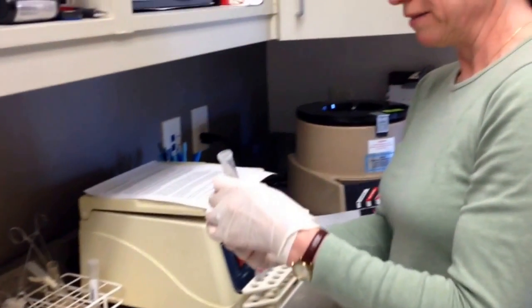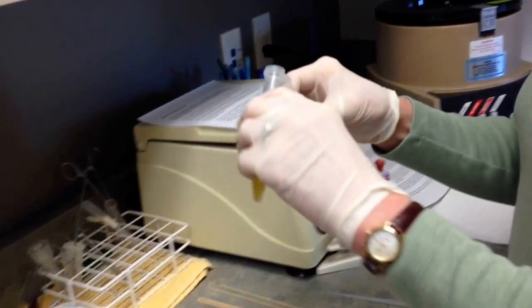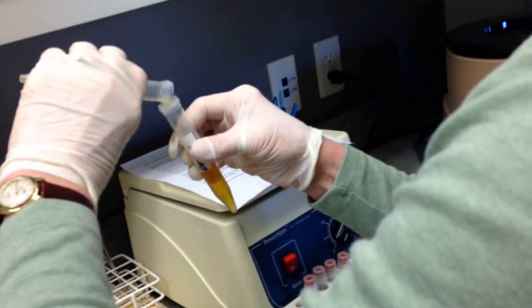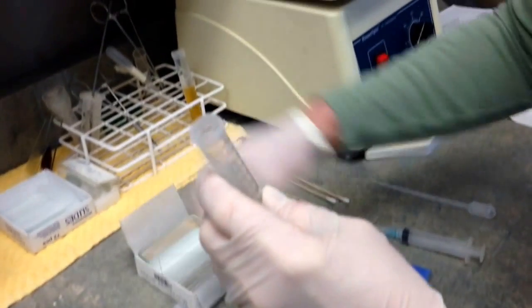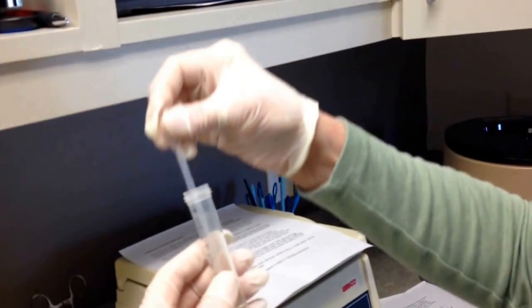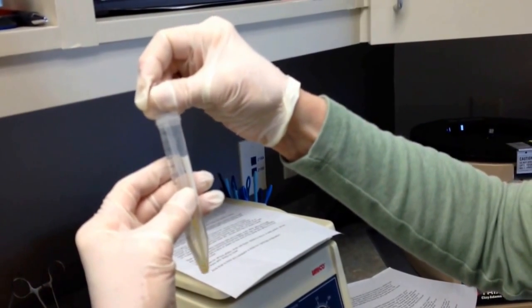If you have a fluid sample such as a urine or a body cavity effusion, you want to use a method to concentrate those cells so you can create the best slide for evaluation. You'll centrifuge your sample — here I have one that I've already centrifuged, it's a urine sample. After centrifuging, transfer the supernatant into another clean tube and save that. Don't pour it down the sink because you never know when you're going to need it. Take a couple of clean slides and a transfer pipette to re-suspend the sample in the little bit of liquid that's left.